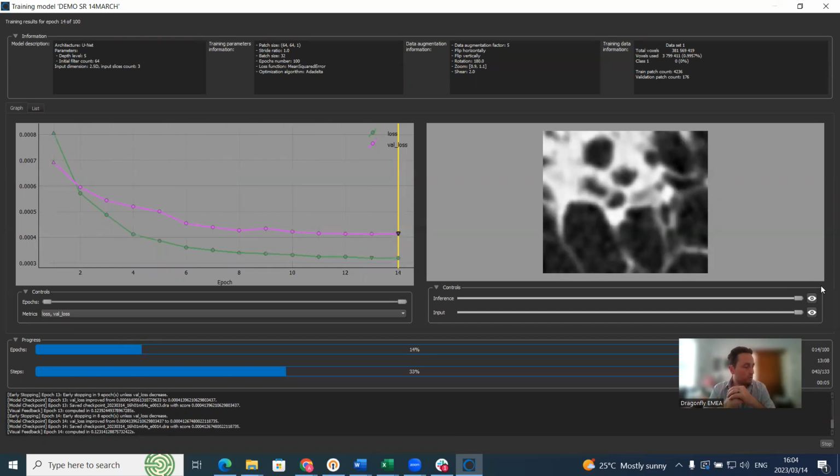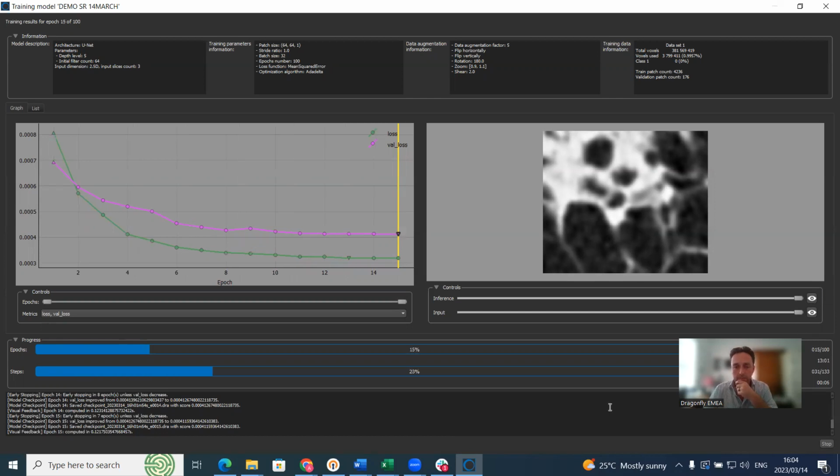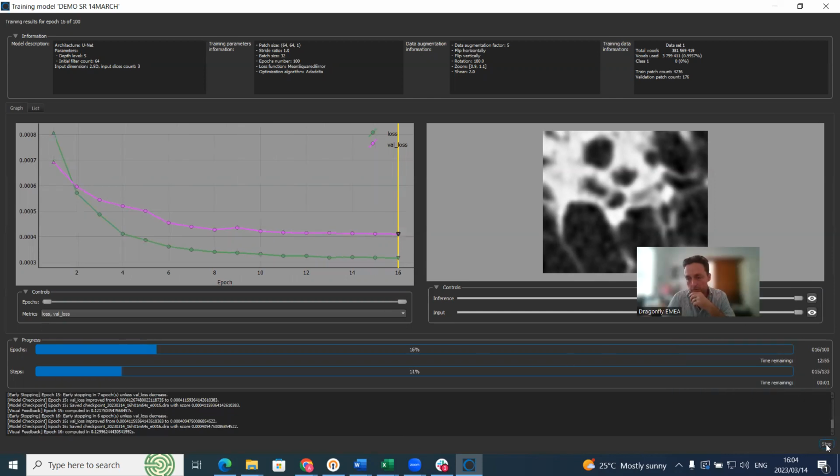different options are possible. So it would be great to see what you achieve with these tools. A lot of things are possible. So I think I'm going to stop it there. You can see that it's sort of plateauing out, and I'm not going to try to create the best super resolution model in the world today.